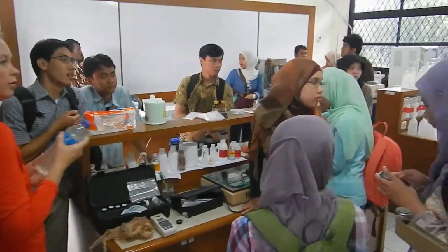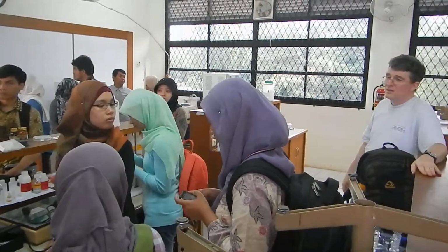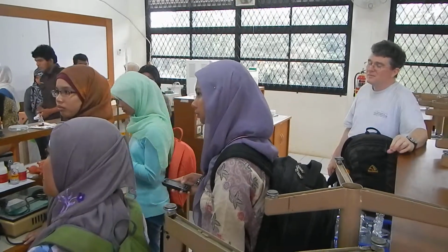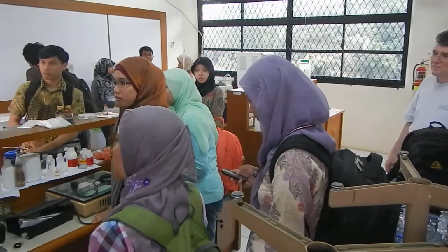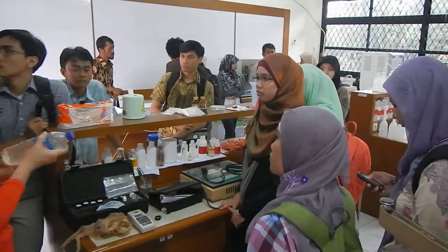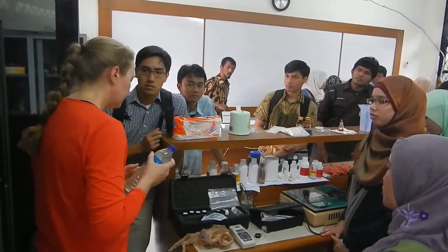Is the dilution linear? In other words, if you dilute, do you get a linear response? Most of my samples I don't have to dilute. Some of them we've got off the mine, but I usually don't have to dilute. Once I get about 800 on mine, above it I have to dilute, but a lot of them I haven't. So I've never really tested it where I've diluted everything to see if I get the same relationship. It's a good question. I don't know. There might be something out there on that.